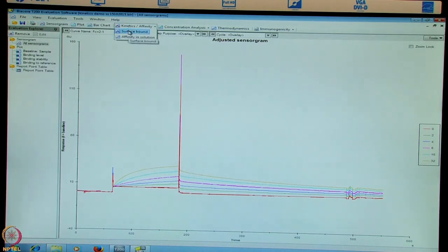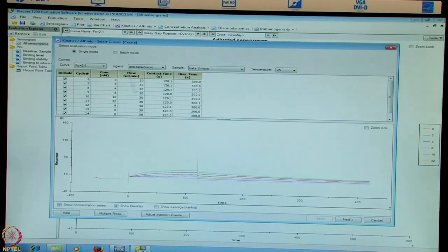Select surface bound. The data is shown here. Here you can see the different cycle numbers, different concentrations of the beta-2M ligand at a flow rate injected of 30 microliters per minute. Contact time of 120 seconds and dissociation time of 300 seconds. We have selected 2 minus 1 surface. The ligand that is immobilized is anti-beta-2 microglobulin. And the sample is beta-2 microglobulin or analyte interaction performed at 25 degrees centigrade.